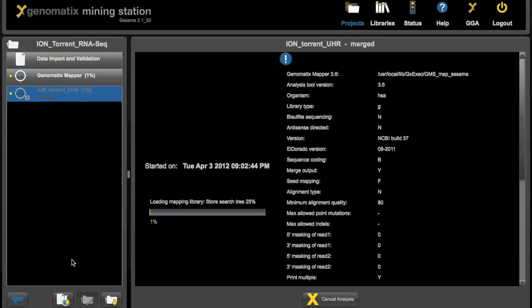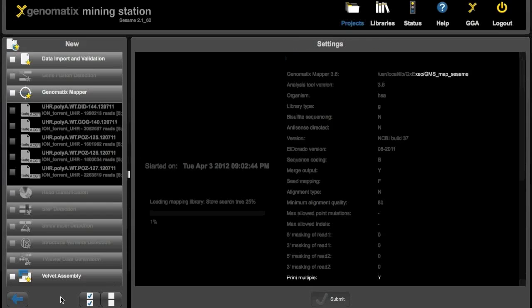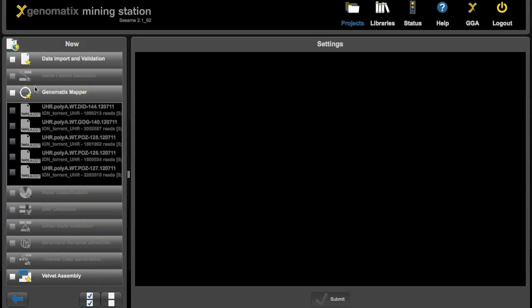So while this is running, we can just start a second analysis using human brain reference files.